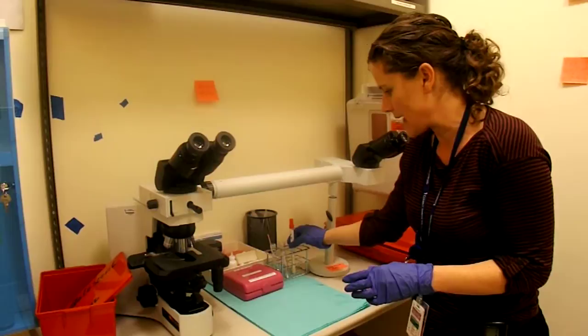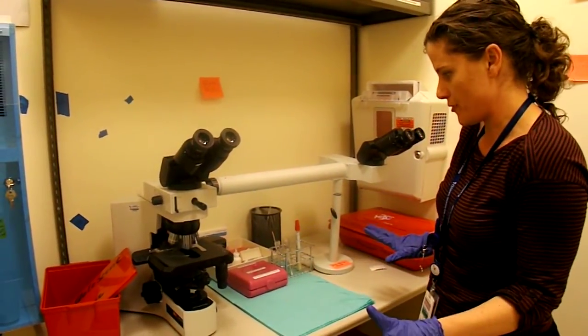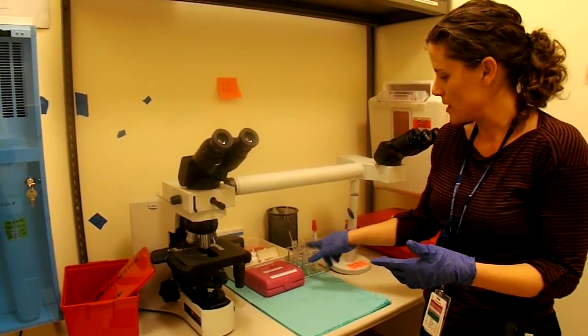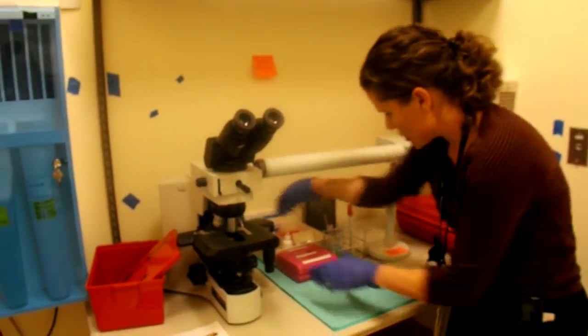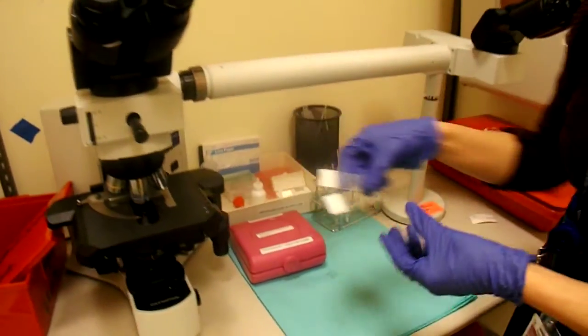So when you come into the lab, obviously you're going to be wearing gloves. This is the area for the microscope. You have to try to keep it as clean as possible. Always put your labeled tubes in here, and the first thing you're going to do is set up for your wet prep. If you can see, there should be all your supplies here.